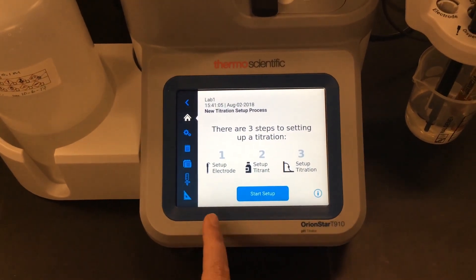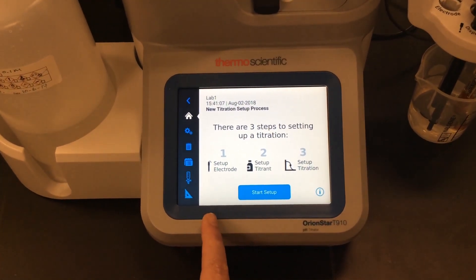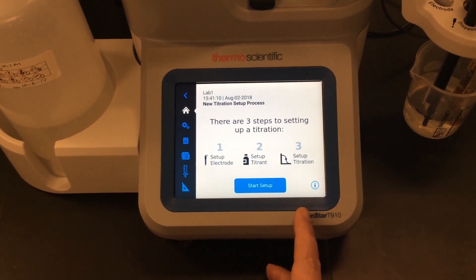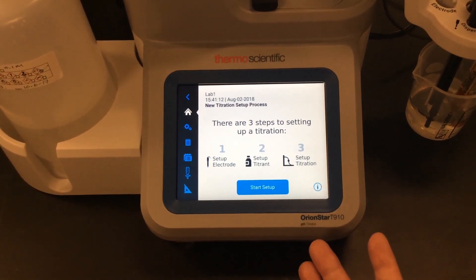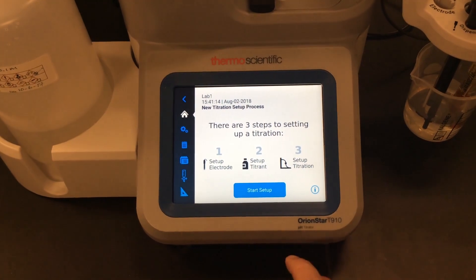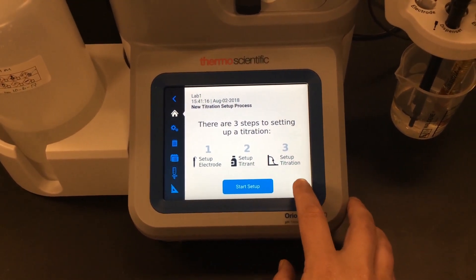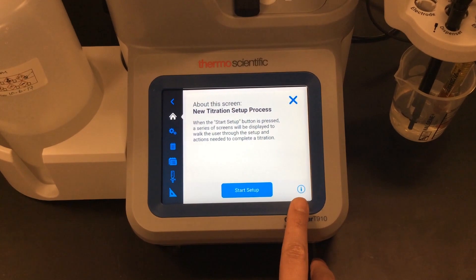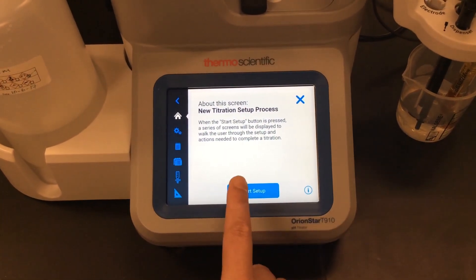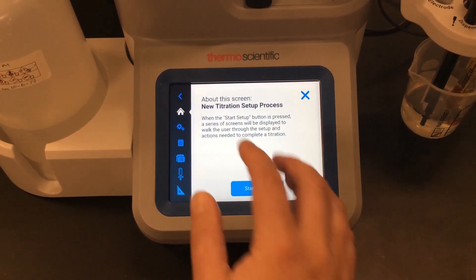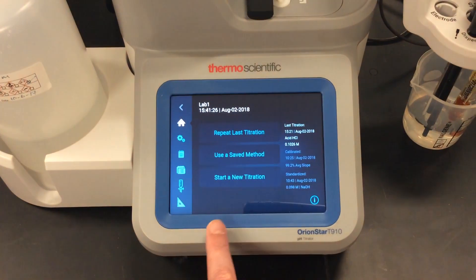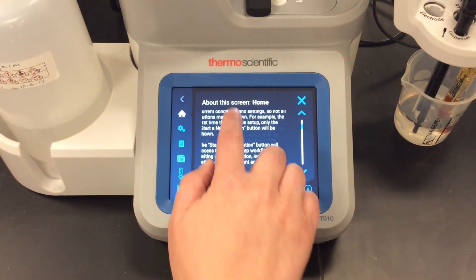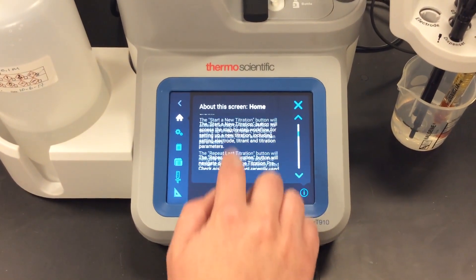I can press the start a new titration button and start a whole new titration using the titration setup wizard, which walks me through my electrode settings, titrant settings, and titration settings, then lets me save it as a method to use again. I can also press the info button at any time if I'm confused or need assistance — the titrator will explain the screen and give helpful tips. This info button is available in most screens and provides valuable information as you learn your titrator.